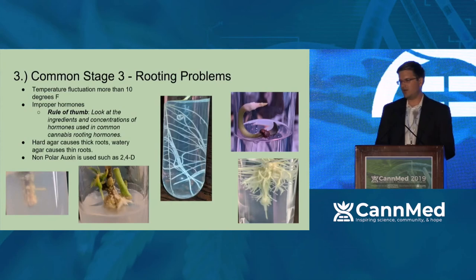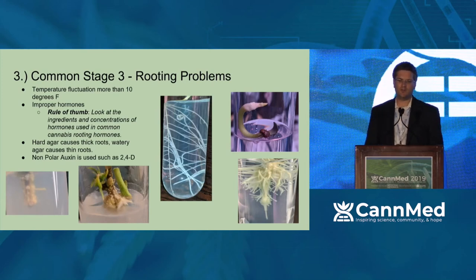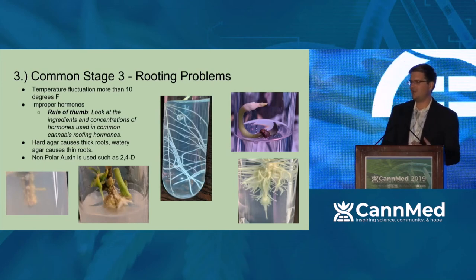So if you look at common stage 3 rooting problems, one of the biggest ones I ran into at first was I was using T5 lights, those small little bulbs, essentially, and my temperature fluctuations would change more than 10 degrees, sometimes up to 20 degrees between day and nighttime temperatures. I realized very quickly that was one of the biggest limiting factors and switched to complete LED lights for my tissue culture. It almost overnight fixed my problem, all of them, which I couldn't believe. Just the temperature fluctuation alone, potentially some of the light created some of that.